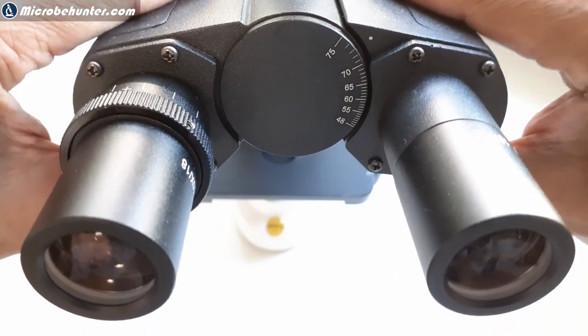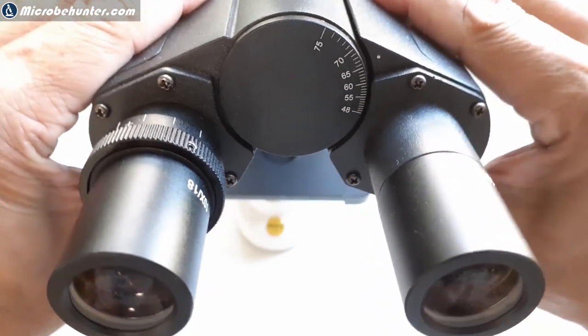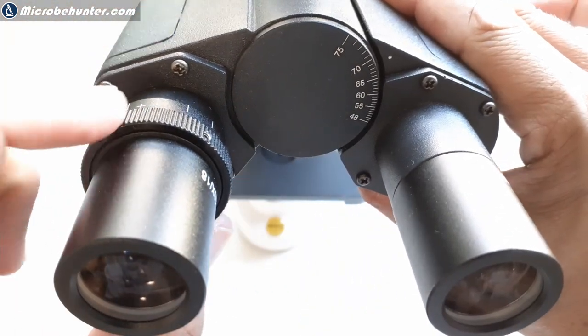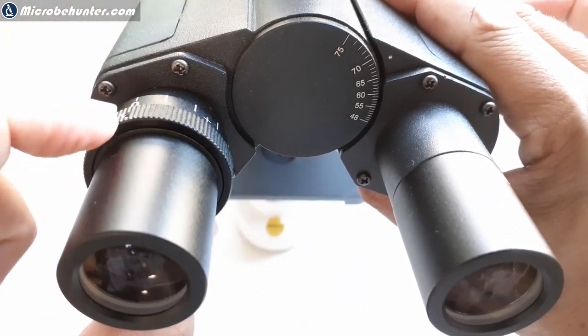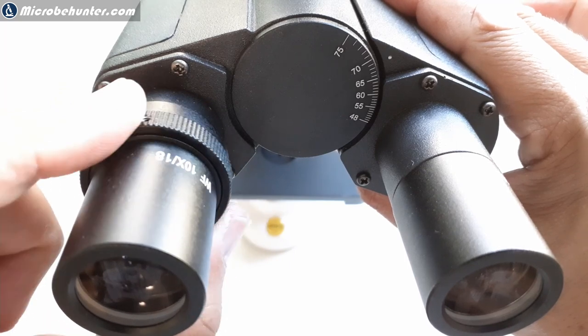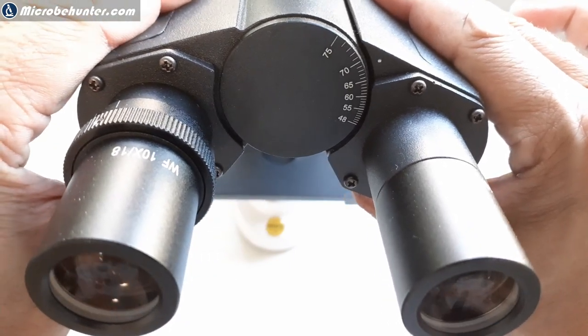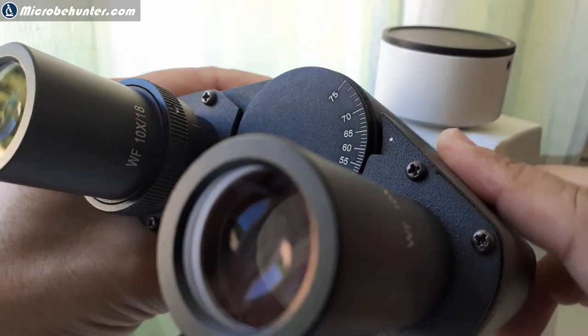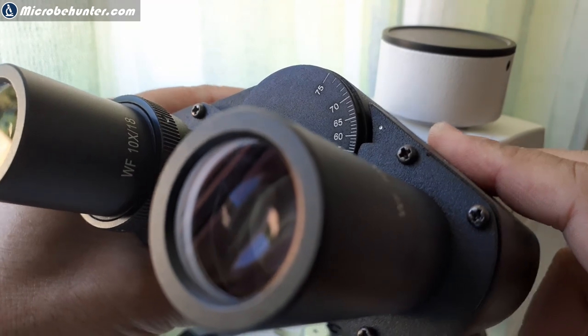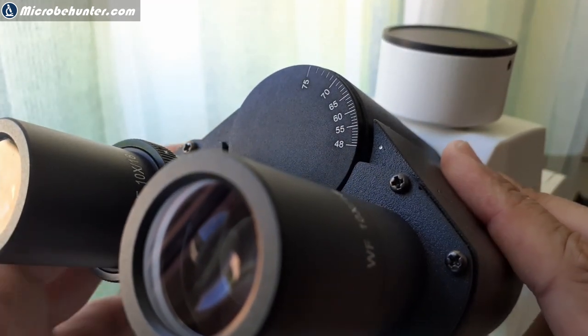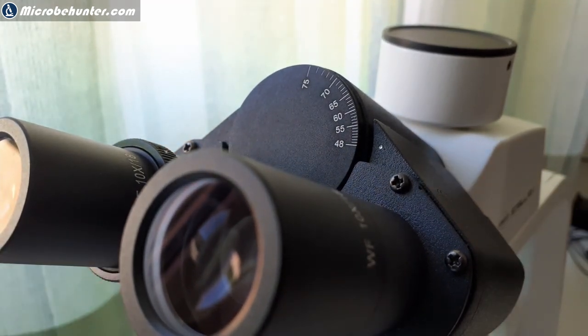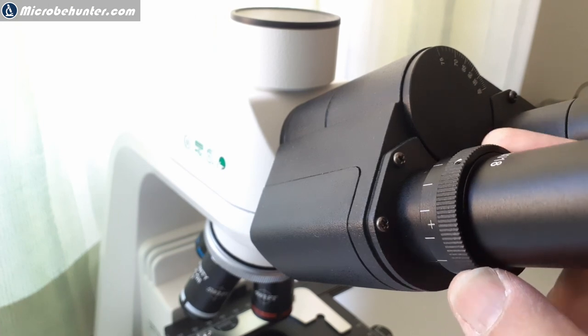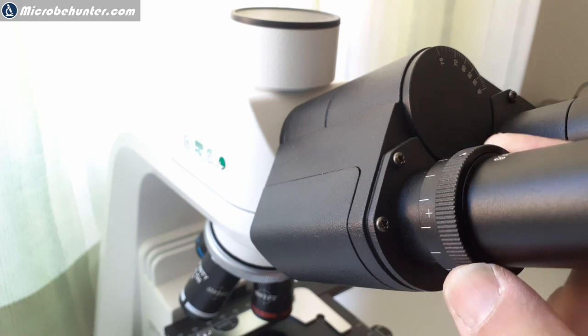Here you can adjust the eye distance. And at the same time, you can also move the trinocular head back and forth. And on the left eye piece, you can adjust the diopters in case you have two unequal eyes. And if you do not want to wear glasses, you can adjust it. Here, you can easily adjust the eye distance. So here, we can have a closer look at the diopter adjustment again, and everything rotates nicely and smoothly.